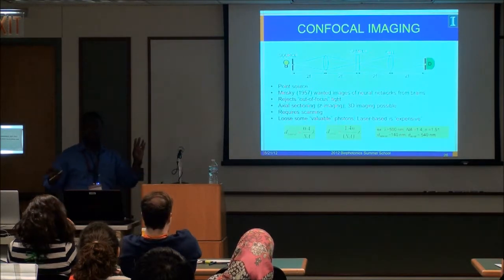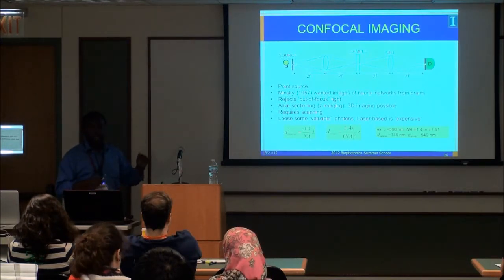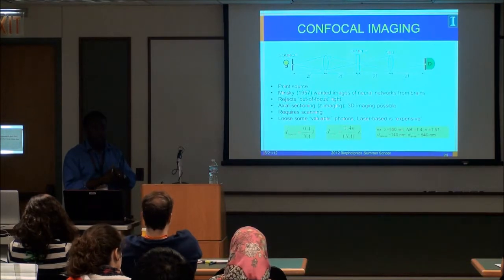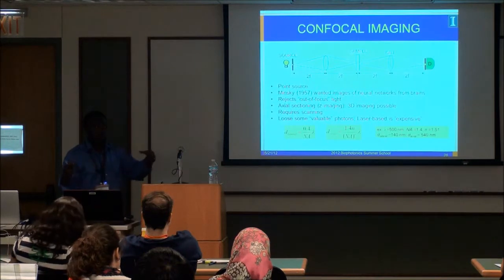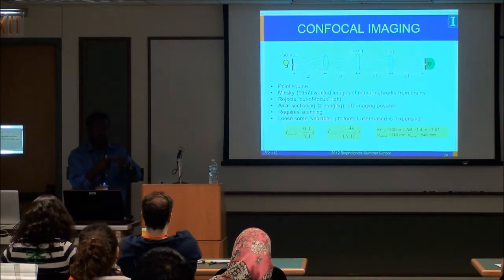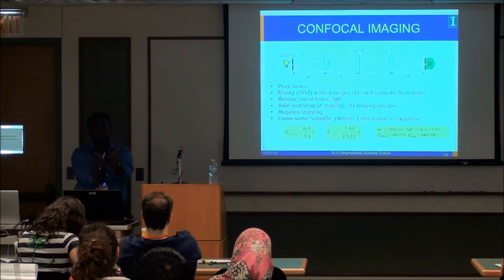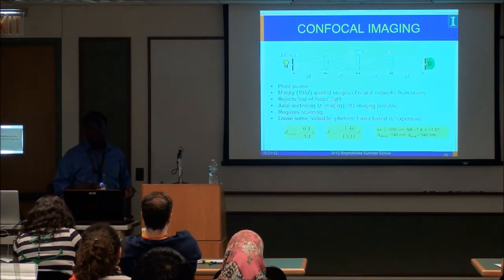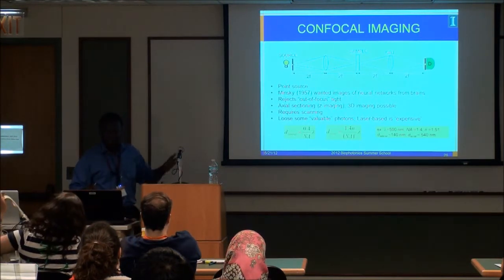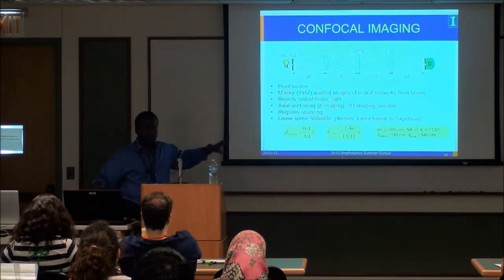And if anyone's curious, from the perspective of point spread function engineering, one can think of this pinhole idea as introducing increased wave vector diversity. The moment you move them closer and closer and reduce the spatial extent of your points, so you approach a point source, you're increasing the spread of your wave vectors. So the more diversity you have in the sample, the more information this thing can carry. This is something like what Mats Gustafsson, who came up with the structured illumination idea, recognized, and he figured out another way to do this without the pinhole.